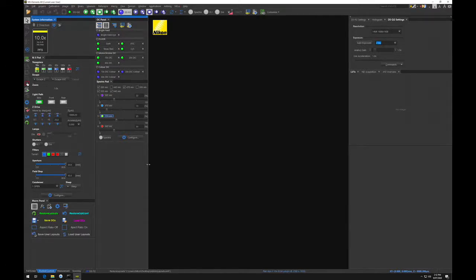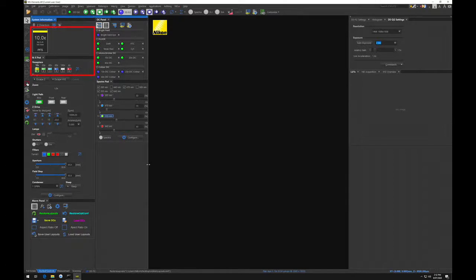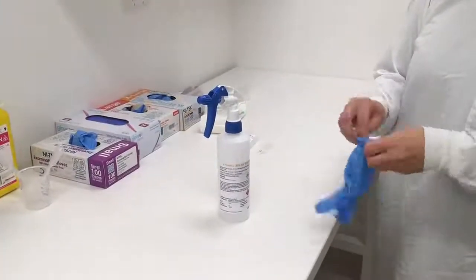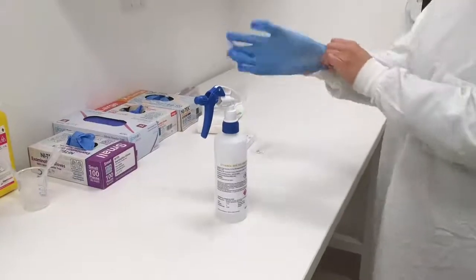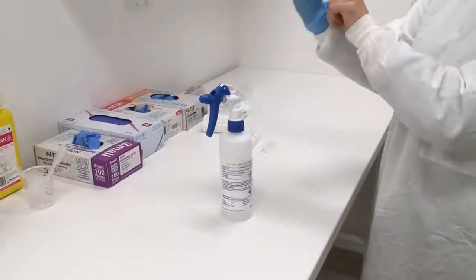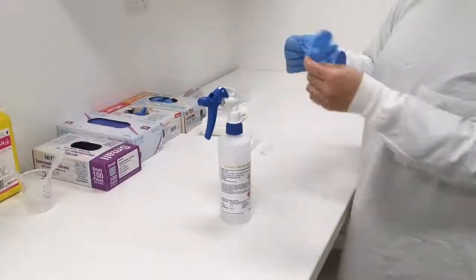The microscope should start off with a low magnification lens in place. Please switch to the 4x or 10x magnification if it isn't already there. Now you are ready to place your sample on the microscope stage. Before doing so, put on a pair of nitrile gloves.